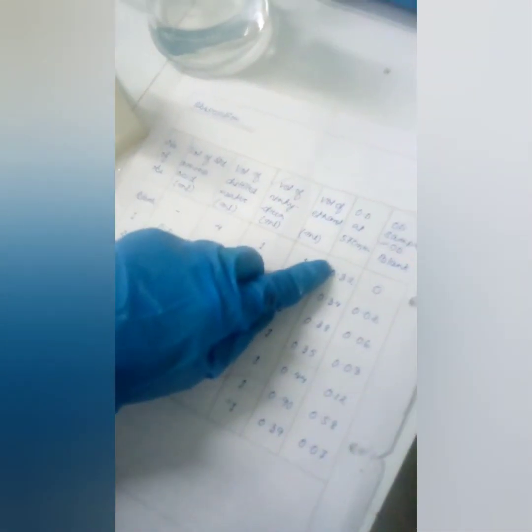I will show you in this colorimeter how to take the readings. You have to note down all the absorbance readings of these samples. After taking the absorbance readings, we will plot a graph.